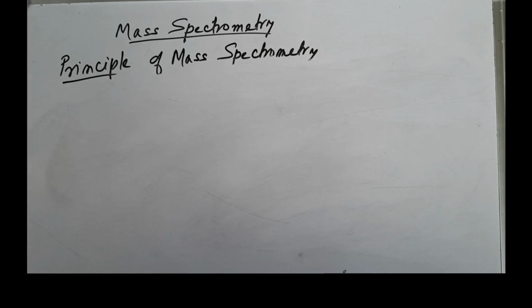So today, good morning. Today we'll have a lecture on mass spectrometry. I'll first tell about the principle of mass spectrometry. The basis of mass spectrometry is the production of ions from neutral species or neutral molecules and the examination of these ions, the composition of those ions.